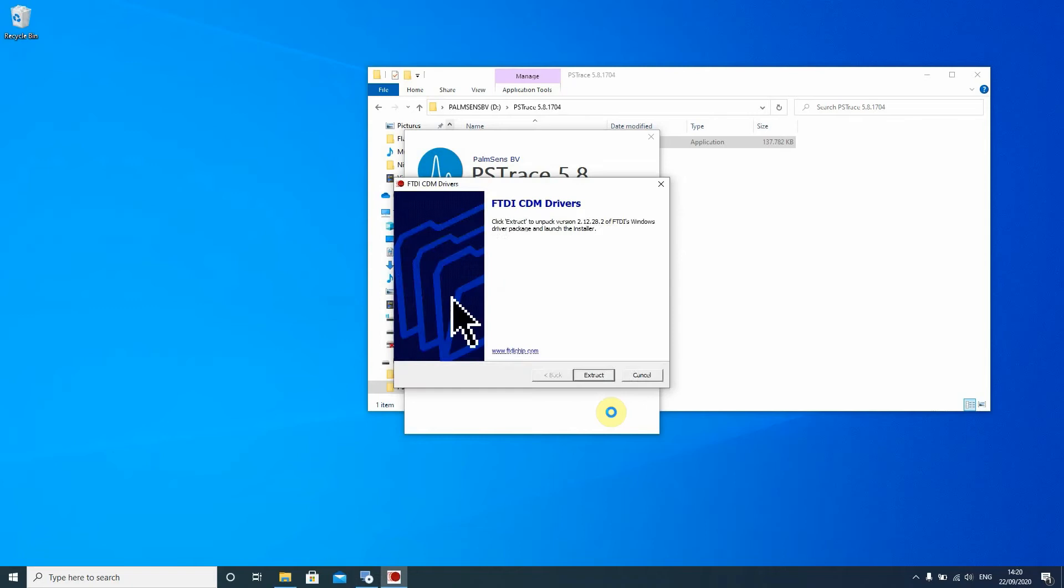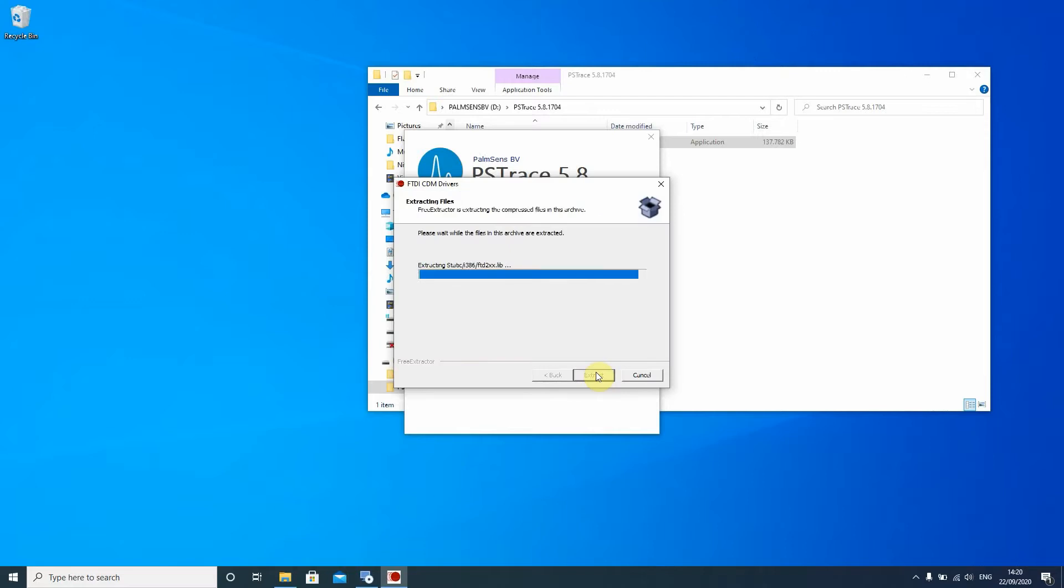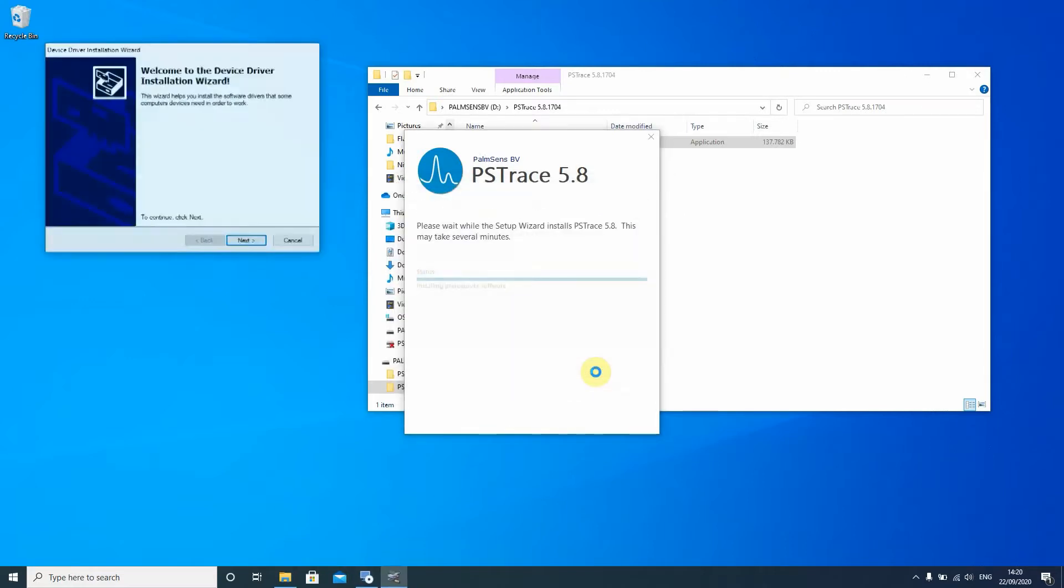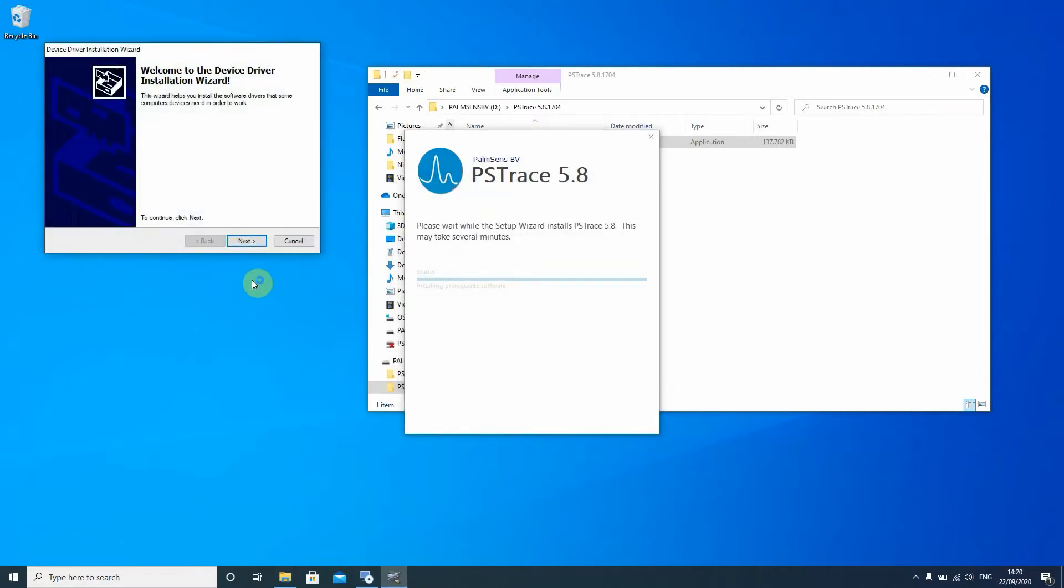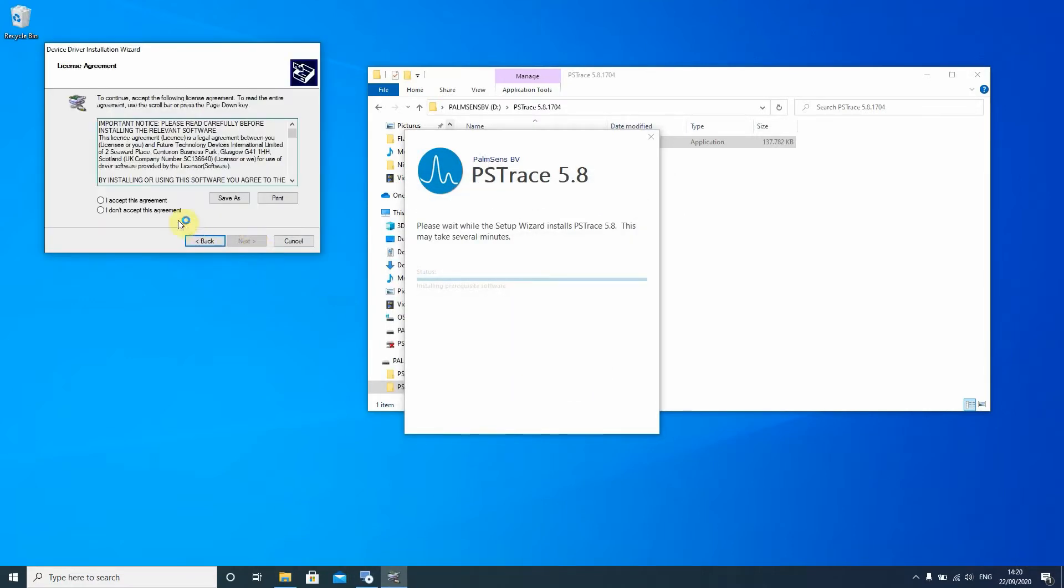Then it will ask you to install some drivers. So you just press extract then you follow the instructions and that means you have to agree to another agreement.